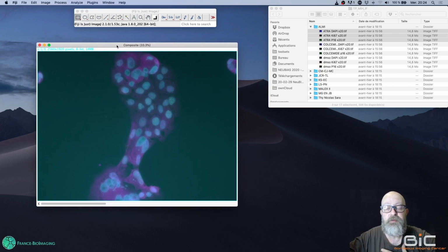The thing you would like to do is have a look at here, the status bar. You see that it's colored. You may also notice that the outline is colored. This is channel number 1 out of 3. And you've got a slider down there to navigate from one channel to another.